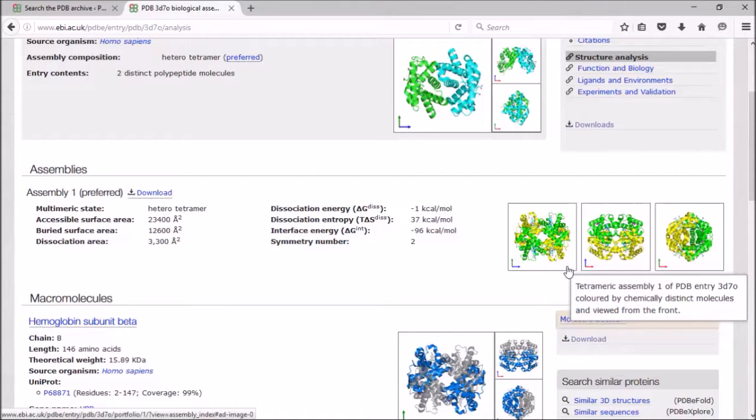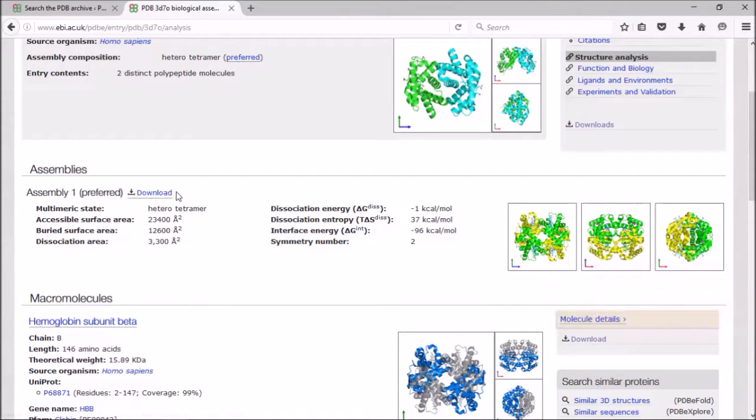Finally, you can also download these assemblies so that you can view them in a structure viewer outside.